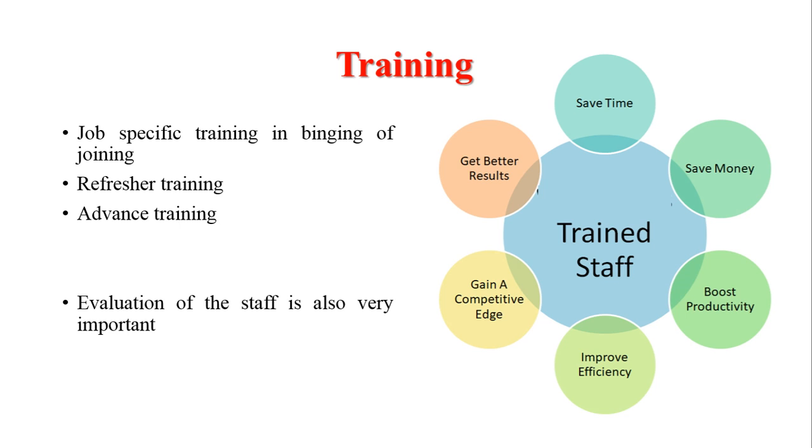However, here we are talking in the context of safety of the staff, right? So to keep the staff safe, we need to give them a lot of training. We need to make them experts of their work, and for that we have to give them training. Now obviously, when some staff is hired into an organization, they are already well educated and well trained. However, when they are joining an organization, there are several things which have to be taught to them, or they have to be trained for several new things. So we need to give these new staff different trainings at the time of joining.